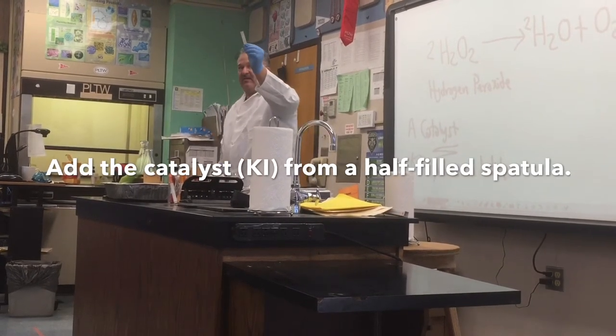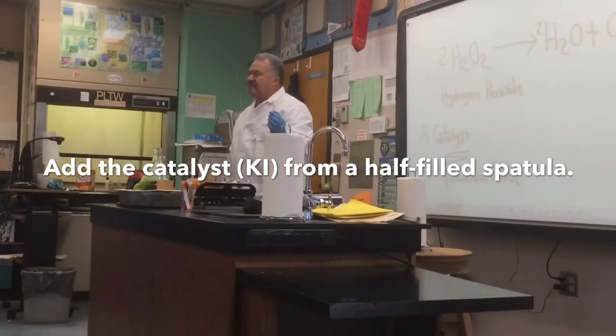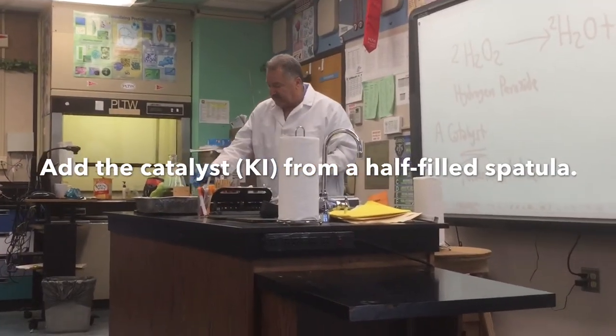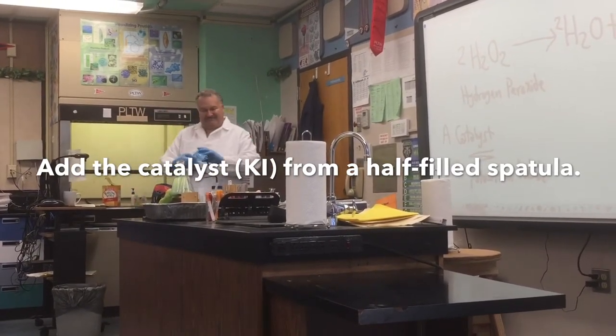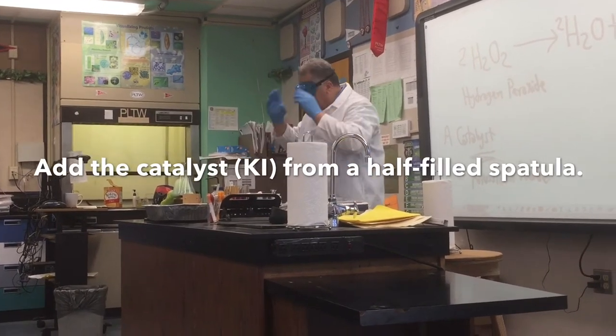Here it is. You're going to miss it. Here's the catalyst. What's the name of that catalyst? Potassium iodide. Do you have a symbol for it? KI. Okay, now what did I forget? Safety comes first. Come on, guys.